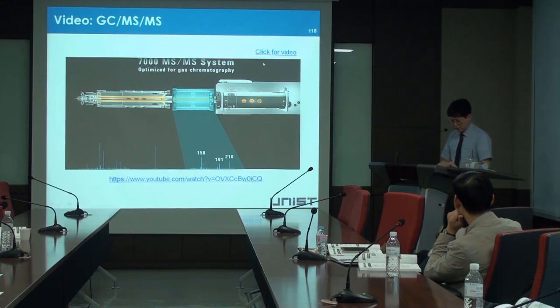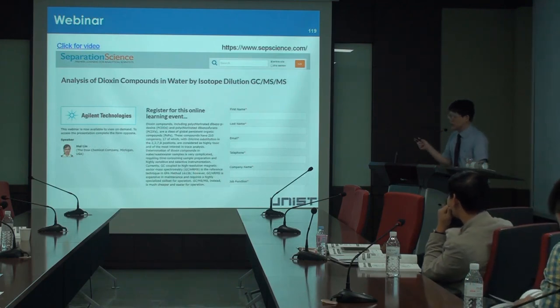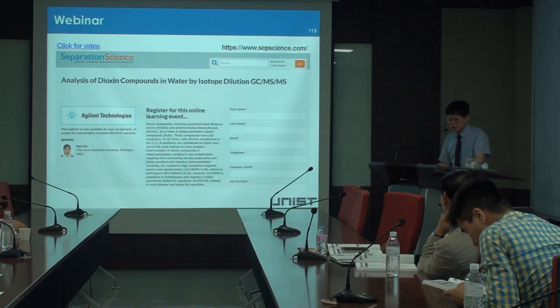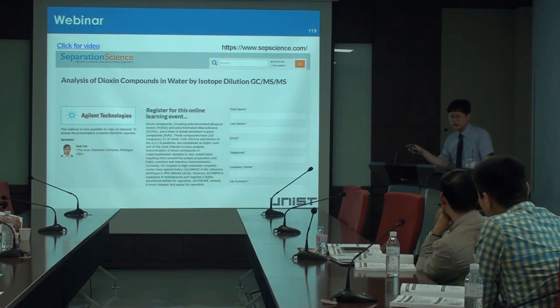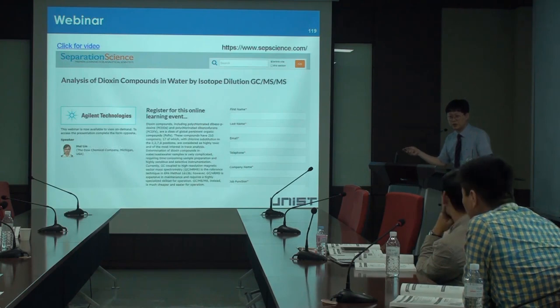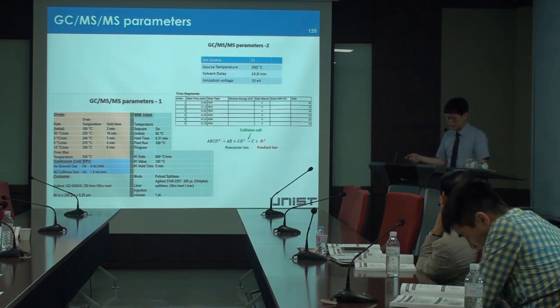Okay, later. Actually, I know it takes too much time. Also, I suggest you visit this website and log in. It's a free website providing this kind of instruction. It is from a company that provides this method, using GC-MSMS. They show very strong evidence that the GC-MSMS system can replace HRMS. There's a video of about 30 minutes, which you can get later. In this video, they provide some MSMS parameters, so more specific input data for the GC-MSMS.